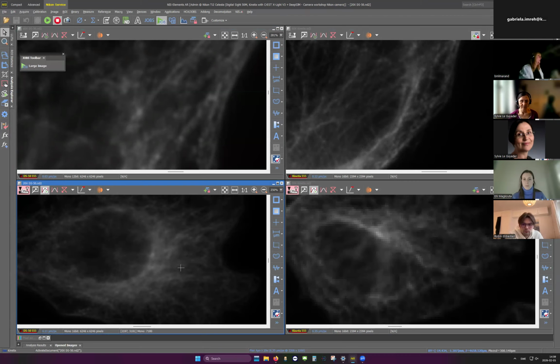But I think it's quite clear that using the wrong camera with the objective you desire, and using the wrong pixel size of the camera, will not give you a good result if we're looking at the 20x. So if you remember, this is why sometimes we add some magnification. It's just about good that you reminded me.